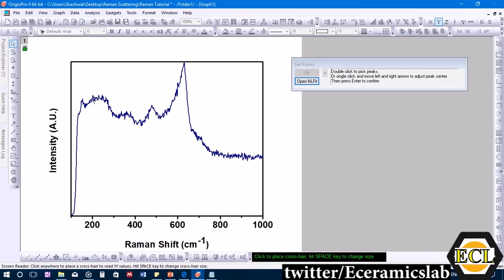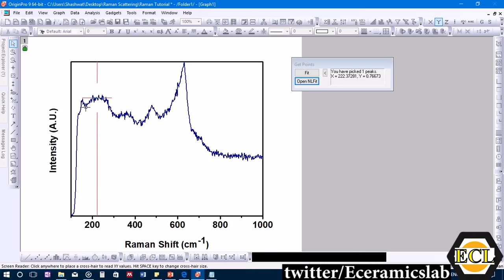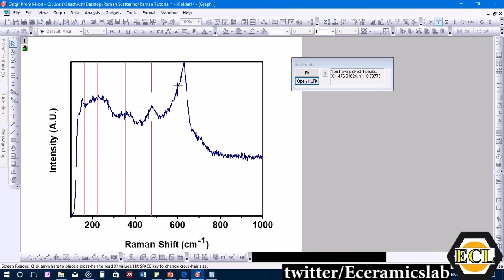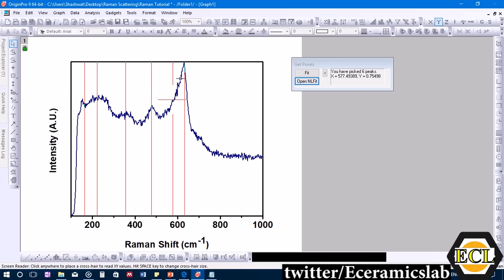Now we select the peaks. I select one peak here, one here, one here, one here, and one that may be a peak — you have to use your intuition. You do the fitting once and check the R² value (goodness of fit). If it's not close to 1, you can come back, adjust peak positions or count, and re-fit.